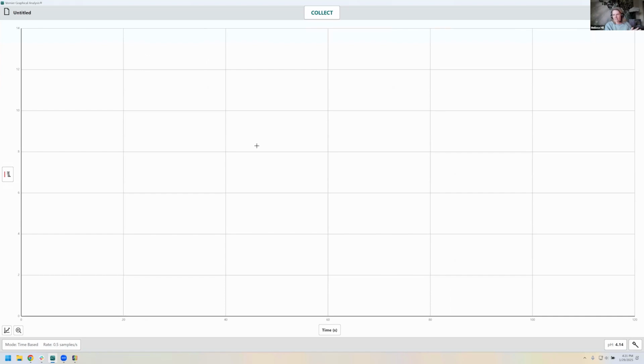So it automatically identifies, just as it does in Logger Pro, tells you pH on the y-axis, time on the x-axis, and now what do I do, right? So a lot of you were very used to opening experiment files, probably. And when Verl went through kind of the history of it, experiment files were really important when sensors did not auto ID, when you had to go in and tell it, this is a pH probe. When we came out with auto ID sensors, that really wasn't as important to do, but it was still kind of baked into habit.